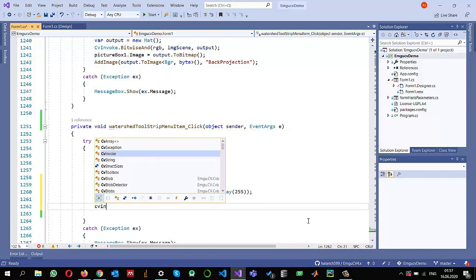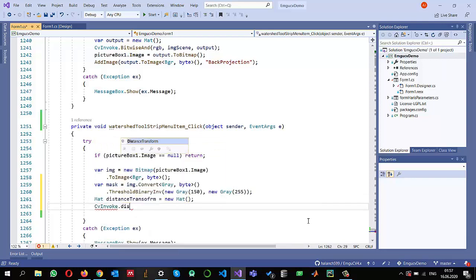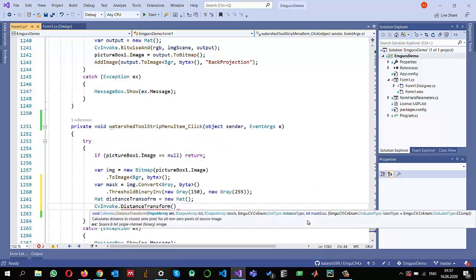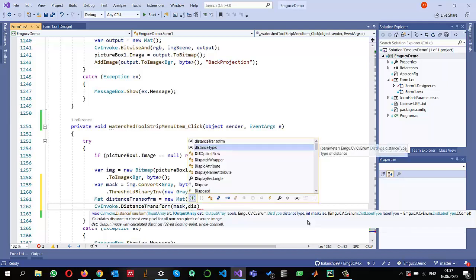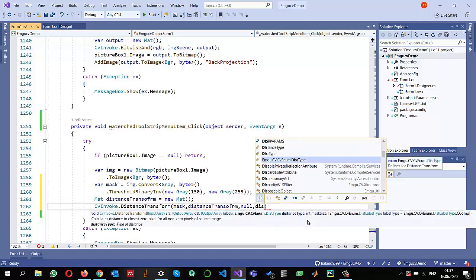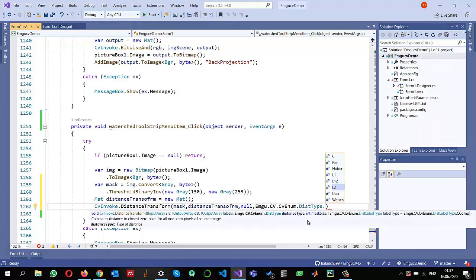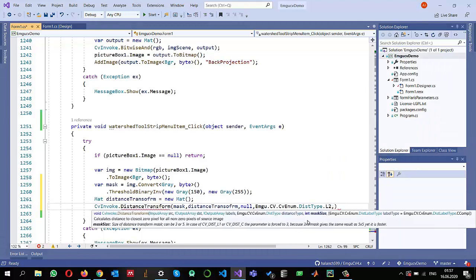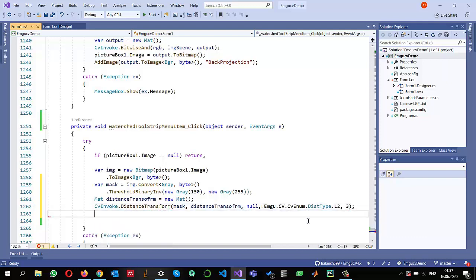I will call `CvInvoke.DistanceTransform`, passing the mask as input and `distanceTransform` as output. I don't need to store labels. The distance type I am using is L2 and the mask size is 3 (a 3×3 mask). This will find the distances and store them in `distanceTransform`.